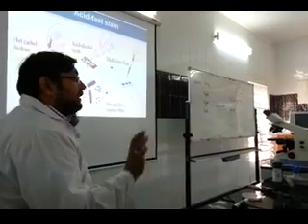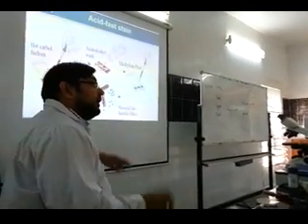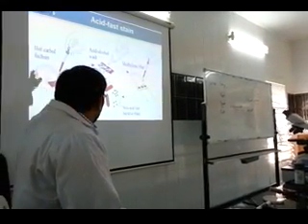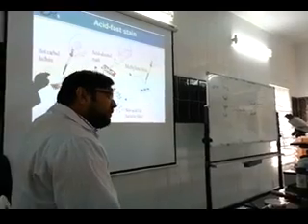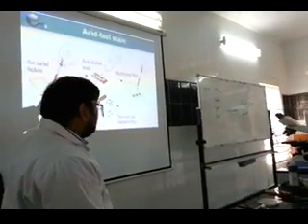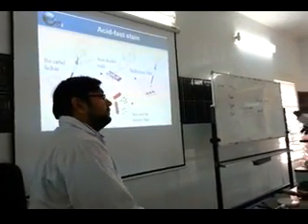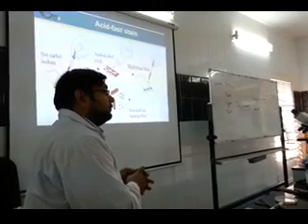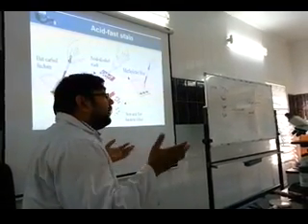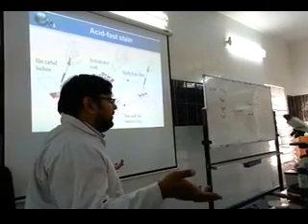The first color they will keep. So even with acid, they will not give out the color. Like Gram-positive, they keep the first color, the red color that you give them first. Okay, so red, wash, doesn't give out color, keeps red. Non-acid-fast will not appear until I put blue. Yes. Because you have to check now. You don't know if it is acid-fast or non-acid-fast. Okay?